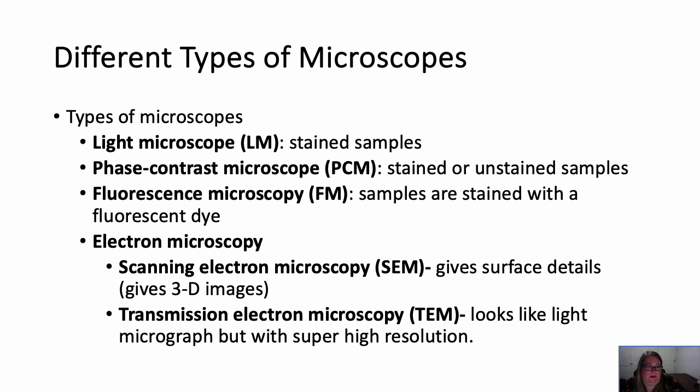Okay, this is when we use a stain that has a fluorescent dye, and we use different wavelengths of light to excite the fluorescent dye so we can see certain microbes underneath the microscope. Okay, light microscopes, we also sometimes call these bright field microscopy or bright field microscopes. Phase contrast microscopes and fluorescent microscopes all use some version of light in how they work.